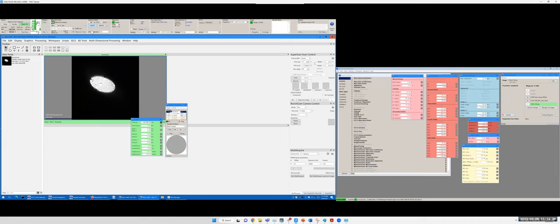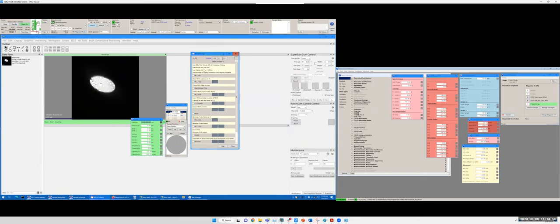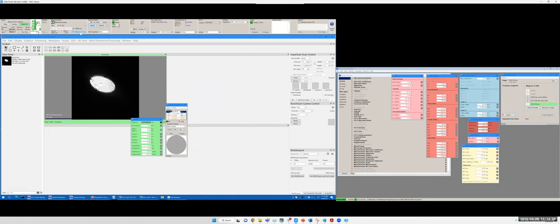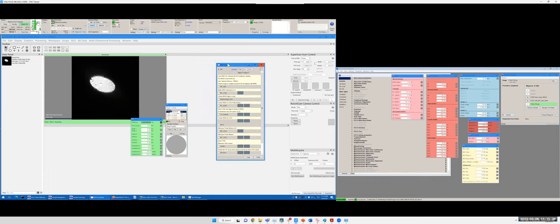You want to look at those taskbars. You can see this long horizontal taskbar here, and the important controls are hidden here, MC alignment tools. If you open this window, you will see a lot of procedures. Okay, I close it. Where you find it: you go to this monochromator section, MC alignment tools, click. It shows this window, and then it shows you a step-by-step alignment.